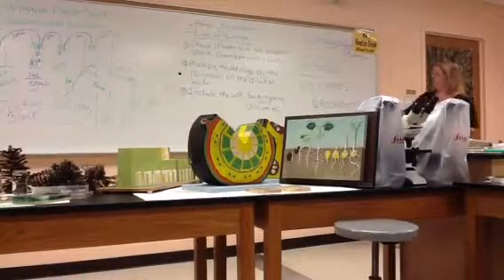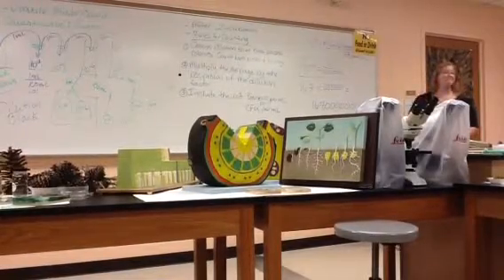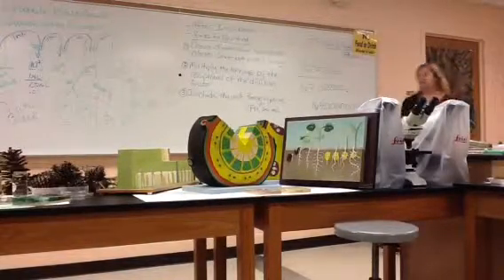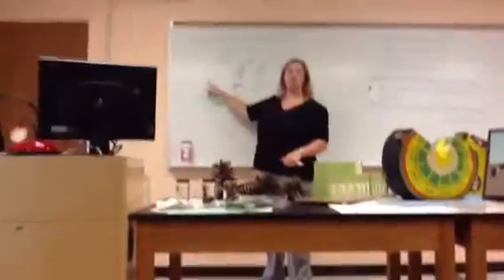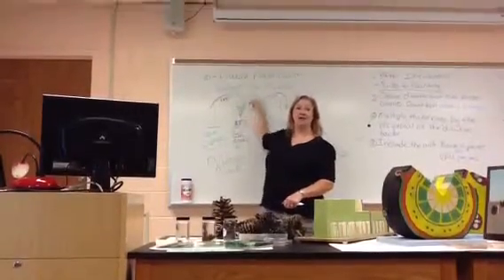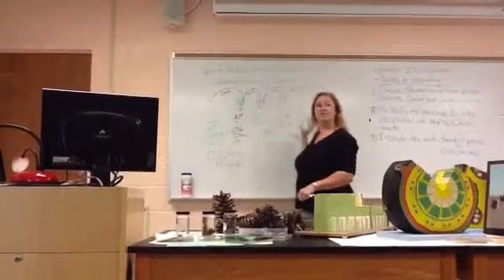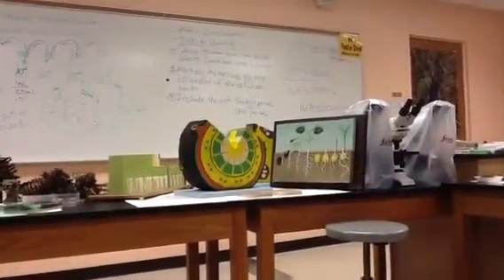This is number 3 here. Include the unit: per ml. That is how much is in the stock culture. And it's per ml because you didn't take the whole stock culture and dilute it. You pipetted a ml out of the stock culture. So all of these numbers that you get are per milliliter. 167 million bacteria per ml.